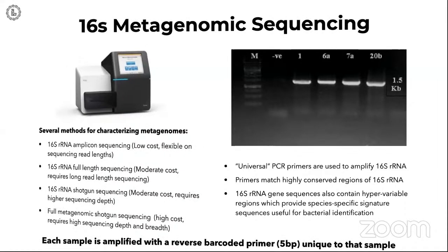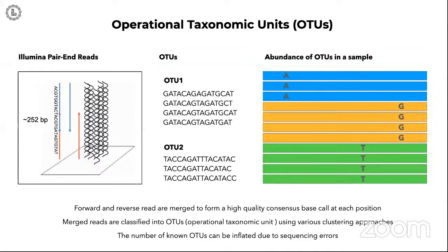So the way that this data is annotated and analyzed is through computational processing, which are called metagenomic processing pipelines. Those are usually utilizing something that's called operational taxonomic units, or OTUs, which can be used to classify groups of closely related individual reads. These OTUs are formed into groups of closely related genomic sequences and represent essentially a cluster that could be assigned to a phylogenetic clade on the taxonomy of the full bacteria that is present in a sample.